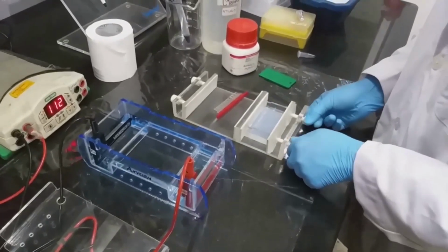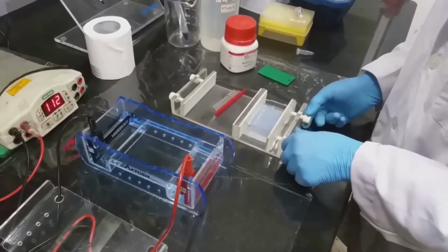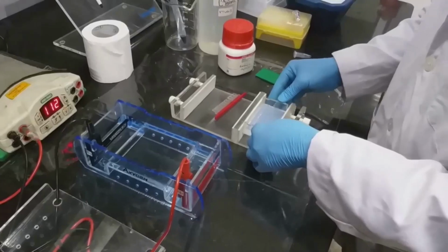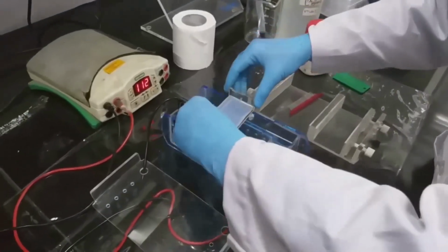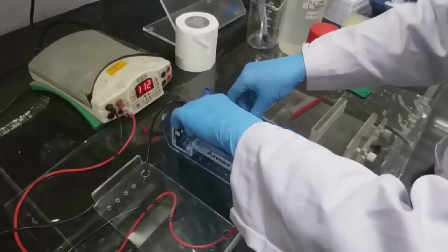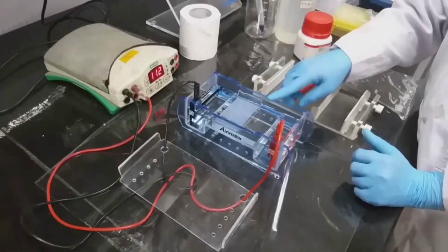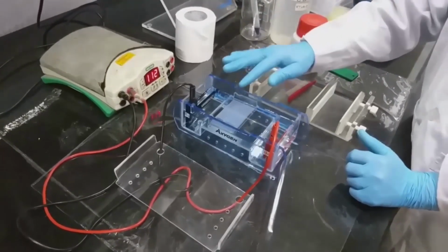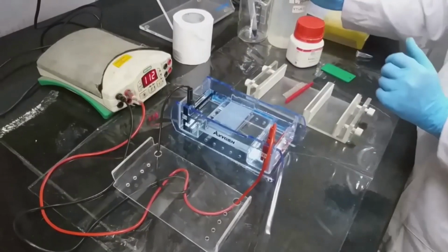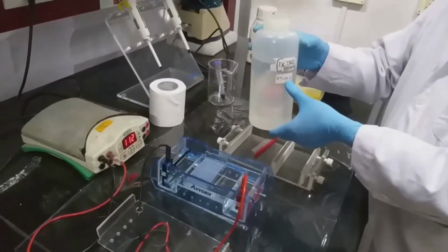Loosen the knobs and keep the gel in the apparatus. Make sure that the buffer submerges the gel. We have to fill the remaining part with 1x TAE buffer.